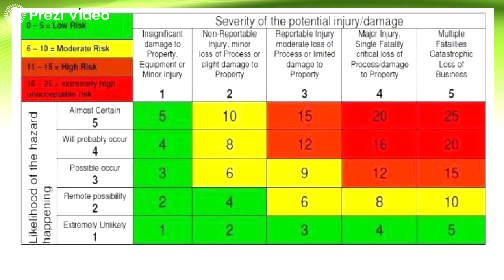So, for example, yun nga, nag-handle kayo ng infectious microorganism sa lab, 'di ba? Kunyari, yung coronavirus natin ngayon, 'di ba? Tapos, yung mga medtech sa lab, wala silang training for the handling of coronavirus na yan, yung COVID na yan. Since wala silang training, di nila alam kung paano, possible na yung mga lab workers doon na nag-handle ng coronavirus na yan, possible na magkaroon sila ng sakit. And we all know that COVID can cause fatality. Pwedeng mamatay dahil sa COVID. That is an example of a multiple fatality.